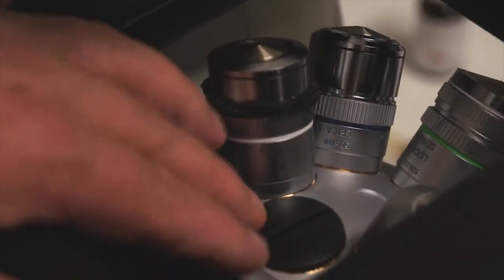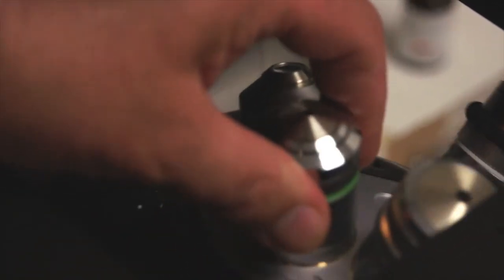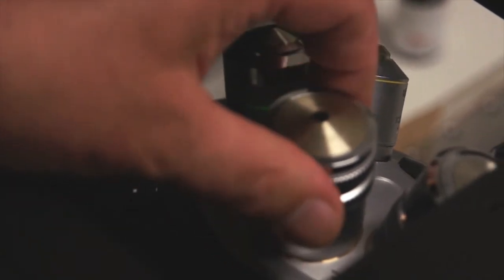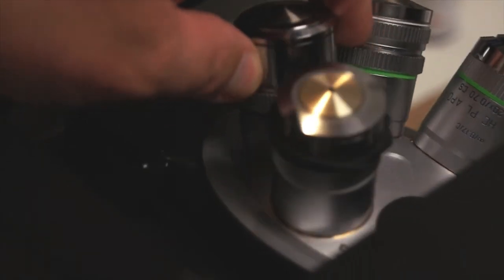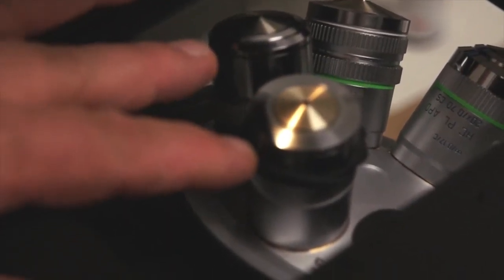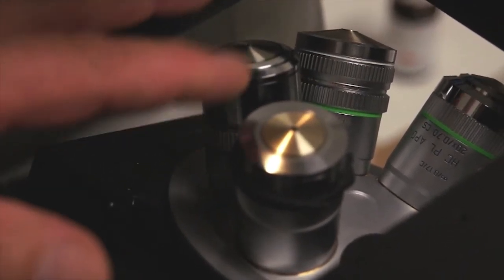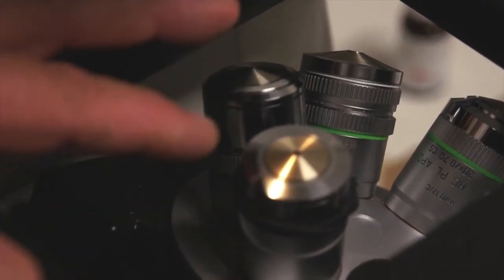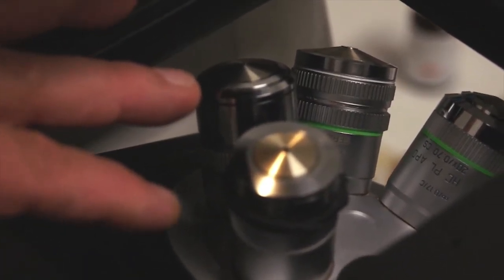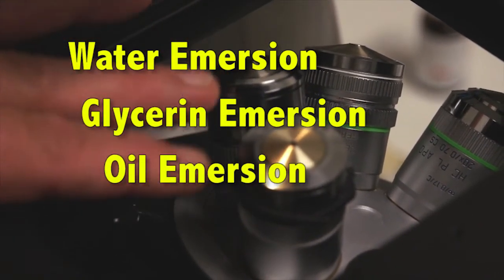Below the stage is the nose piece, which holds all of the objectives. And you can see that there are quite a few objectives on this nose piece. This is a motorized nose piece, but we will be manipulating it manually to choose the different objectives that we work with. Later on in this sequence, we will discuss every objective on here, the magnification of it, and the particular parameters of each of the objectives. Several of them are immersion objectives. They might be water immersion, glycerin immersion, or oil immersion, and we will discuss all these at length.